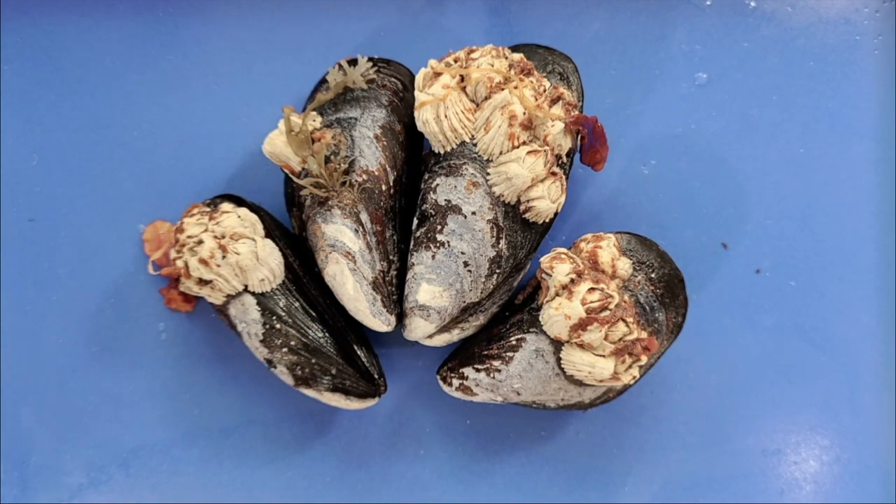Hello and welcome. Today we'll be looking at the anatomy of a mussel.